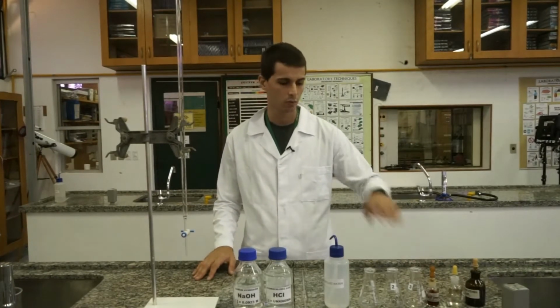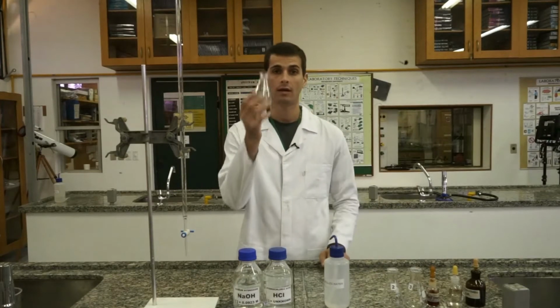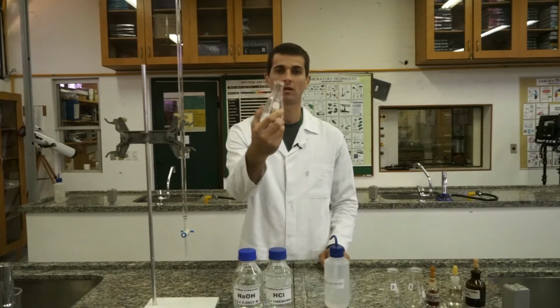And to mark the end point of titration, each of these pH indicators will be added to the ANALYTE that will be in this flask, Erlenmeyer flask.